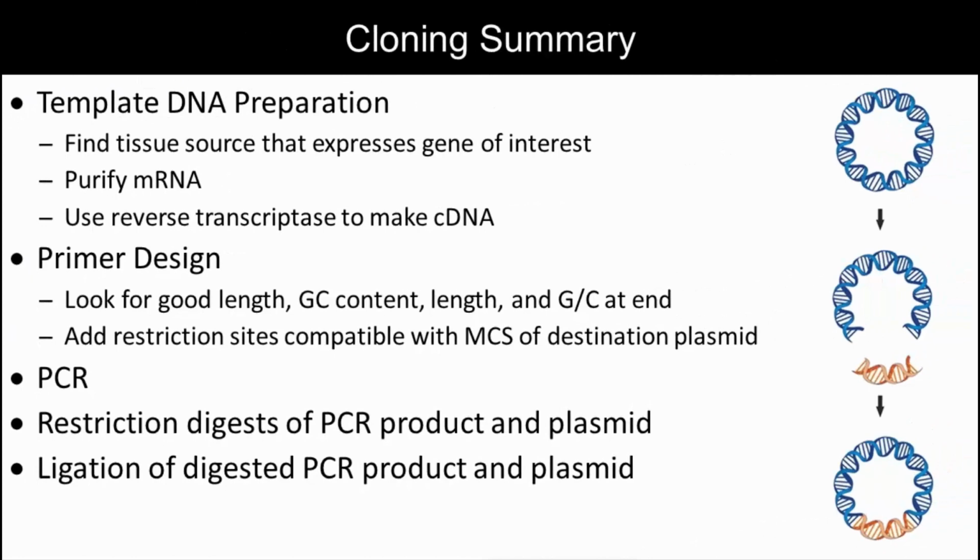Prepare your template DNA, design primers to amplify your gene of interest with the proper restriction sites added, perform the PCR, digest the PCR product and your plasmid, combine the pieces, and ligate. If you join a molecular biology lab, you'll find there's a little more nuance, and a lot of potential troubleshooting if things don't go perfectly at first. But this is a basic framework for cloning your gene of interest into a plasmid. And this is really how we plan out the process in the lab.